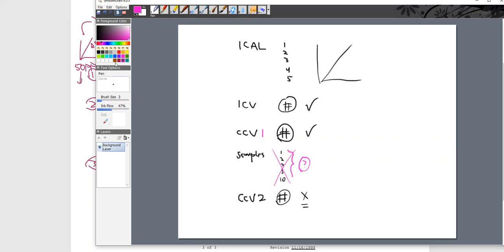All right, well, if that's the case, then let's say that I run the CCV number 2, and when we run the CCV number 2, we get a cha-ching! All right, yeah, woohoo! I'm off to the races again. All right, so what this means now is that my first one checked and my second one checked, and that means all the things in the middle are a cha-ching, cha-ching, cha-ching. All right, okay, that makes me feel really good.